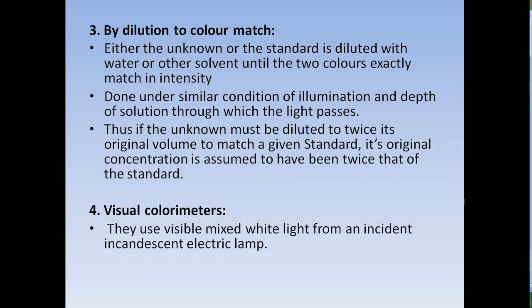Thus, if the unknown must be diluted to twice the original volume to match a given standard, then the original concentration of the unknown is assumed to have been twice that of the standard.